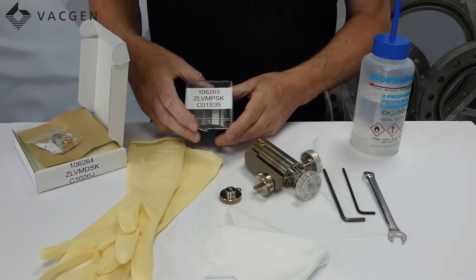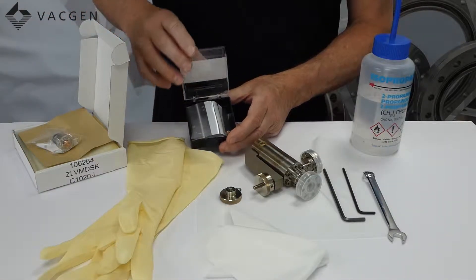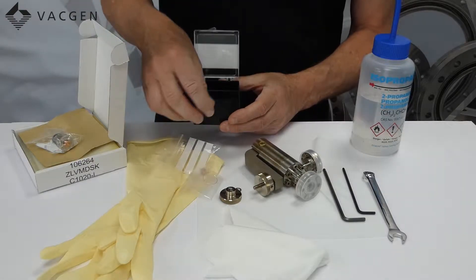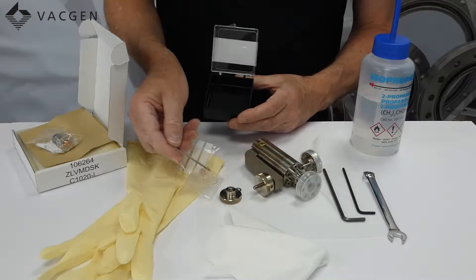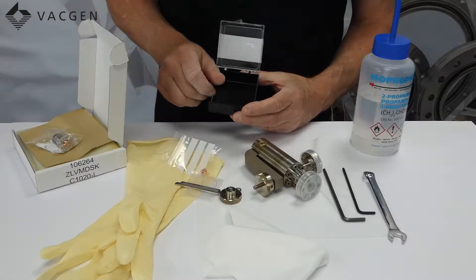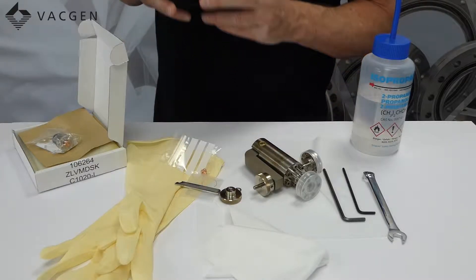The other kit we have got here is the ZLVM PSK, which is simply a pad, a gold seal, and a spanner to do the job. This is the most likely kit that you will be buying, so we will explain a bit more about these.